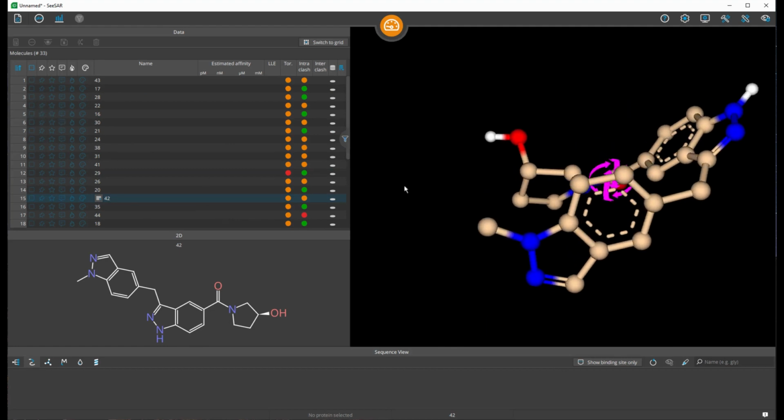Alright, great. Now moving on, let's come to this star-shaped icon whose tooltip text reads "favorite", which lets you know that you could mark certain molecules as favorites by simply clicking on this star icon. An advantage of being able to do this is that you have an option to check only those molecules which are marked as favorites for additional post-processing. So let's mark a few random molecules as favorites, like so.